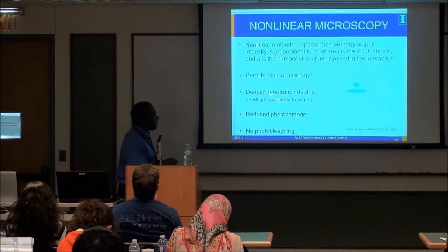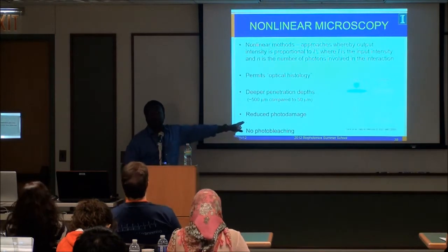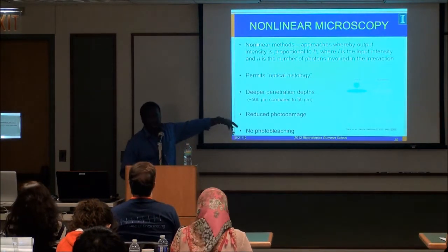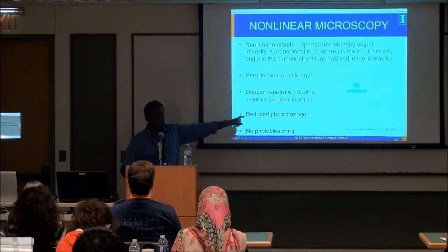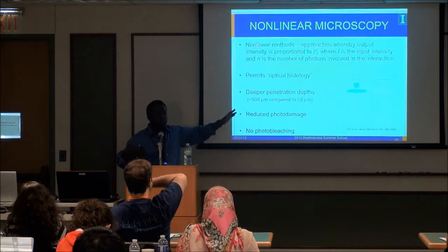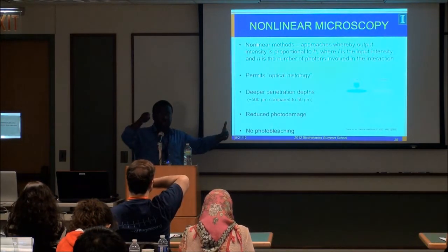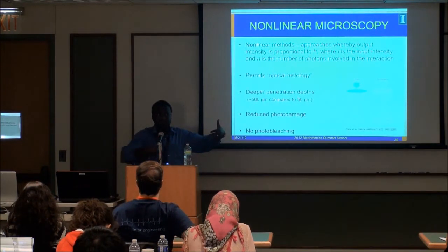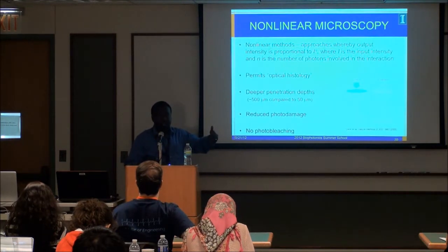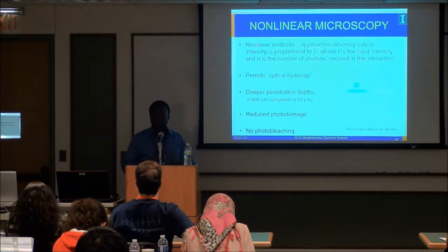With deeper penetration depths, now we're talking about 500 microns. There's a caveat to this. Recently there was a paper published in PNAS that took this down to about 800 microns in depth penetration by doing an additional trick, using something like a spatial light modulator, not unlike the digital light processor in these projectors, to shape the input wavefront as an extra degree of freedom. It's a very cool area of research. Once you start doing that, you can increase your focusing into your tissue. But there's a lot more modeling involved with that.